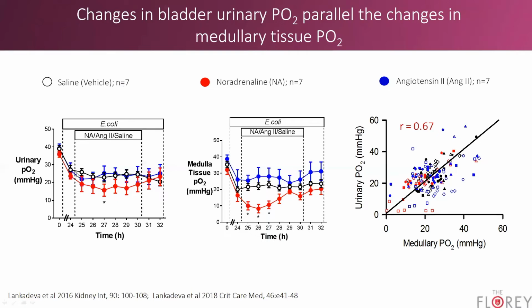And the preservation in medullary tissue oxygenation with angiotensin II was again nicely reflected by preserved urinary oxygenation with angiotensin II treatment. And during all three treatments, we again see a significant and positive correlation between bladder urinary oxygenation and medullary tissue oxygenation.